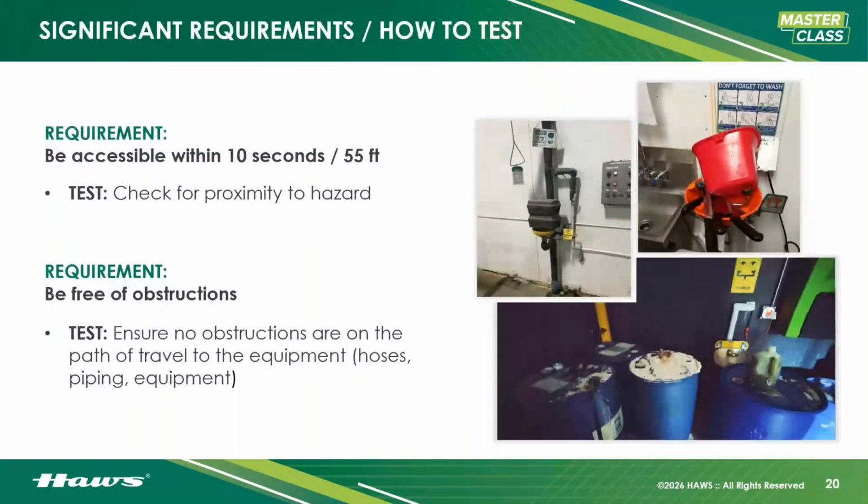Number one, unit has to be accessible within 10 seconds, 55 feet. Now, both of these measurements are very important. 10 seconds is about the amount of time where you will start to suffer more greater effects from whatever it is that you were exposed to.